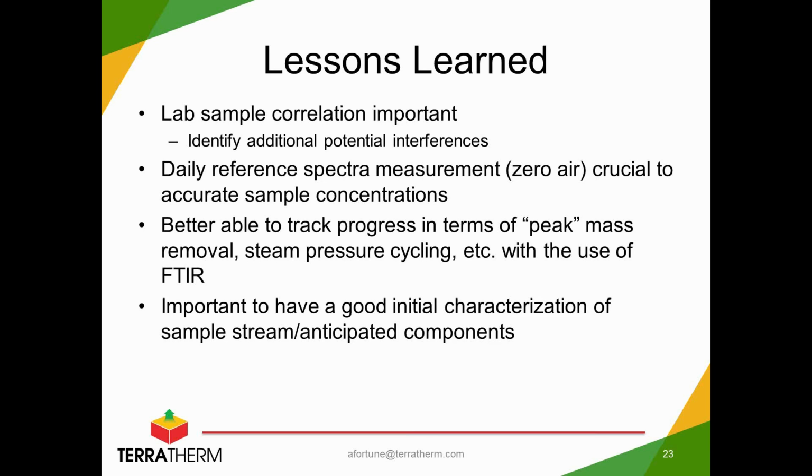We are definitely better able to track our progress in the project in terms of the mass removal. We also had, since this was a combination steam site and ISTD site, steam pressure cycling near the end of the project. We were definitely able to see the results of that in some peaks at the end of concentrations coming through as we cycled those steam pressures. We were able to see that real time.